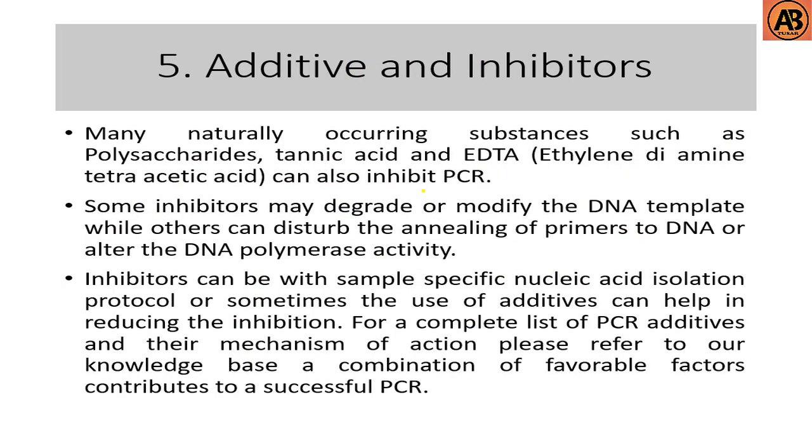And next one is additives and inhibitors. Many naturally occurring substances such as polysaccharides, tannic acid, EDTA, or ethylenediaminetetraacetic acid can also inhibit PCR. Some inhibitors may degrade or modify the DNA template, while others can disrupt the annealing of primers to DNA or alter the DNA polymerase activity.